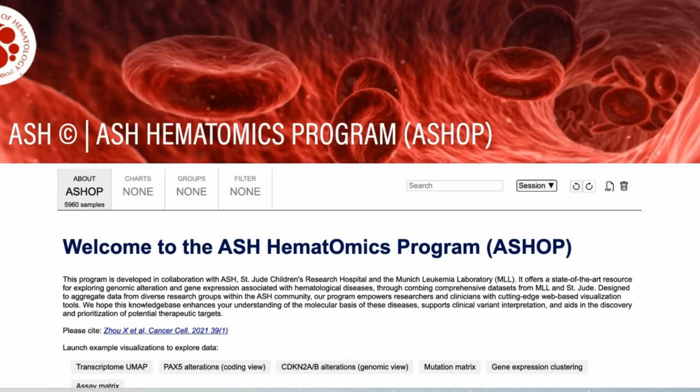Hello everyone, in this video I will demonstrate how we used ASHOP to investigate cell developmental subgroups within the DUX4-rearranged BCP-ALL. We have about 6,000 cases in this program.